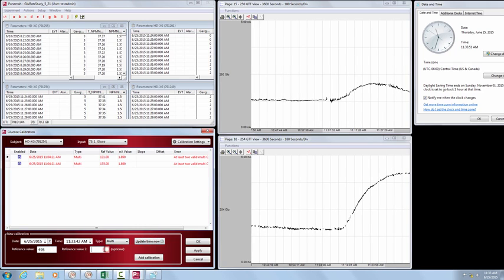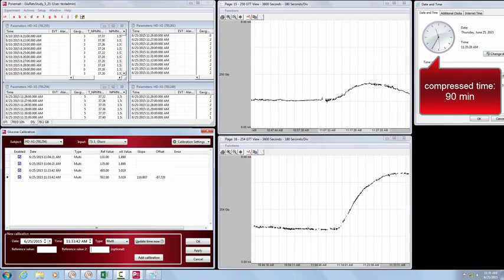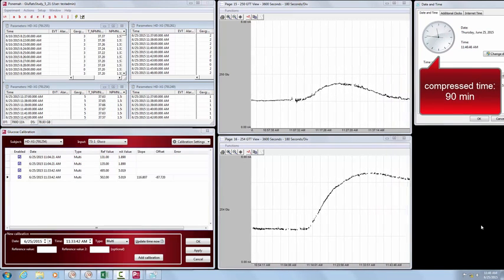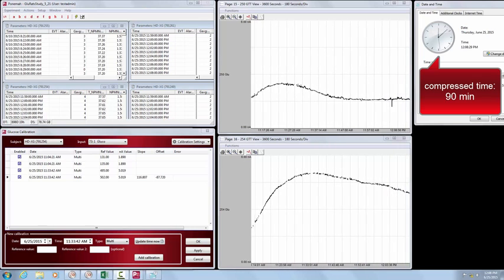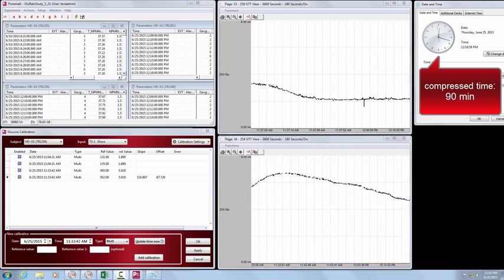A separate graph page can be set up for each subject, as in this example, or separate subjects can be plotted on the same graph page. Either way, the graph pages must be configured before you begin and should not be changed once the calibration protocol has begun.